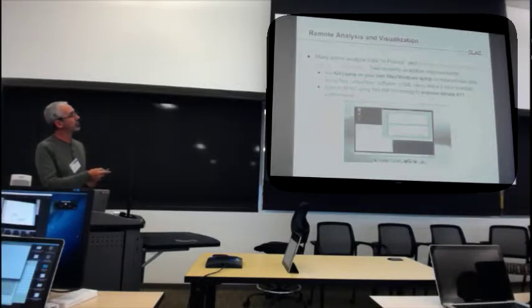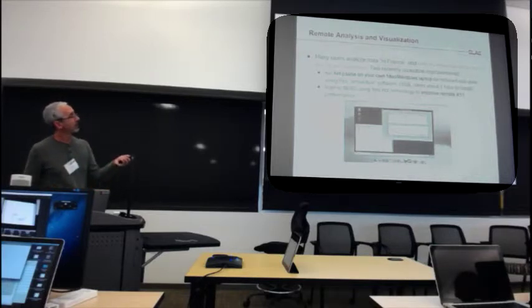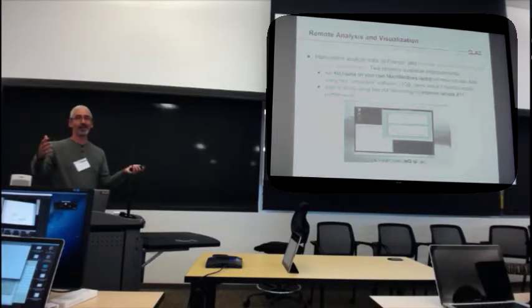So the two improvements, the one I already told you about, you can run full Psana, everything, all the graphic stuff, the whole computer effectively gets put on your laptop in a gigabyte. So that's one option, and then when you're on the plane, you can develop software on a little bit of data. You can't move the petabytes of data to your laptop, but just a little bit of data, or reduced data, which I'm going to talk about a little bit. And in that, you can do on your laptop, and it's fast.